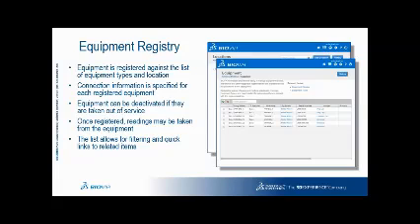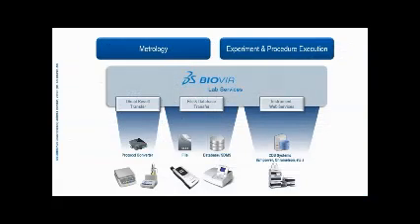You can see it provides some value, but now we can take all of that equipment and we can standardize the way we collect data and standardize the way we store the data, so we can talk to directly connected instruments, which might be RS-232. We can talk to these file-based instruments, and we can talk to the web service-based instruments. And again, truth be told, really we're doing these right now at Amgen, not this one.